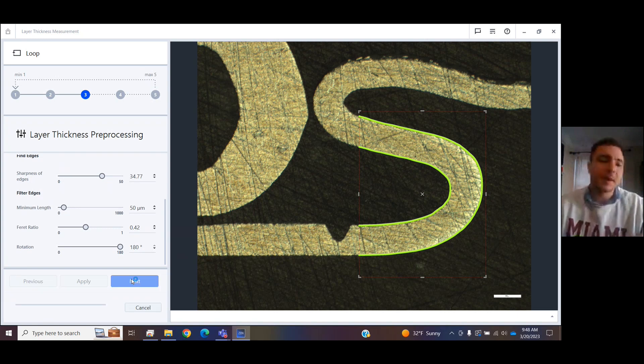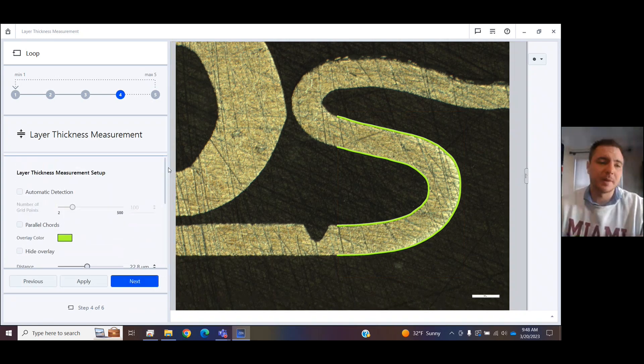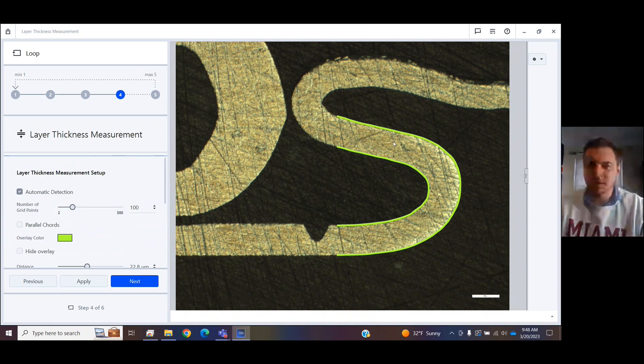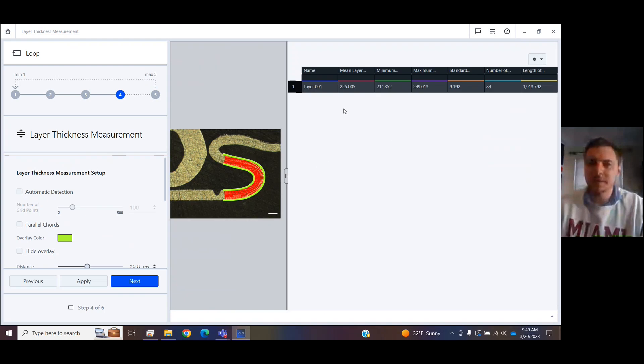And we are going to do the measurement step right here. I want to click Automatic Detection. And I want to click in my layer. And look, it's already shot some information here for me.